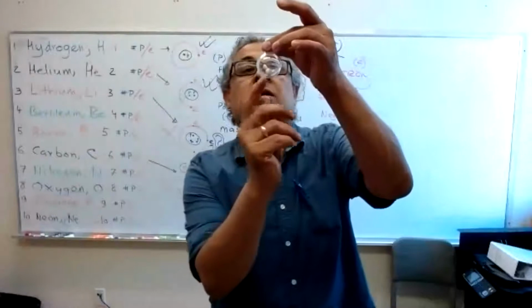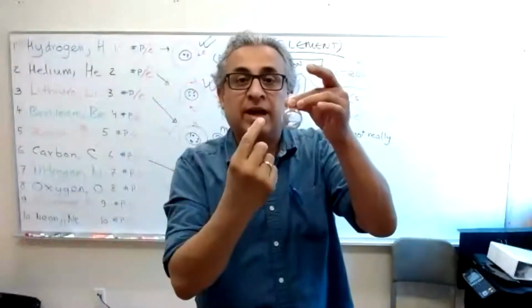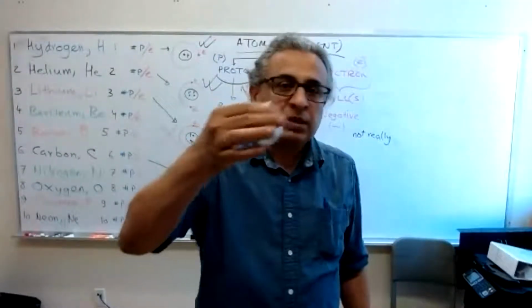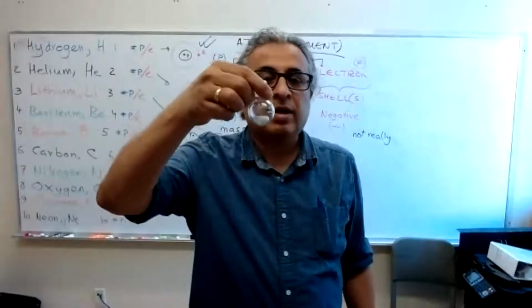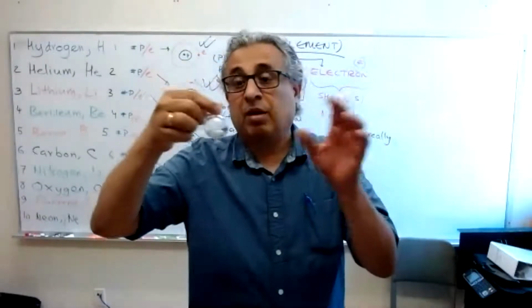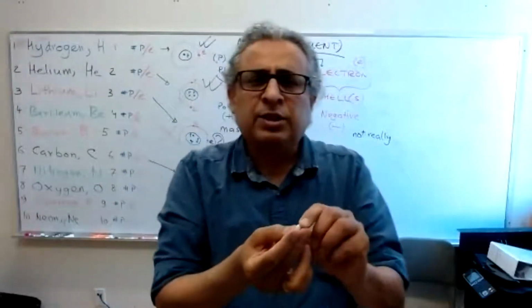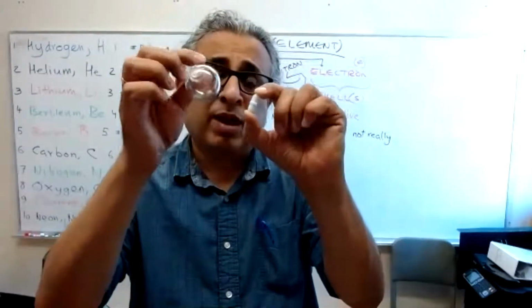So as it starts turning, it churns whatever is inside. Otherwise, the other option would be that for 4 hours, some guy is going to be doing this. Okay, that's ridiculous, right? We are all efficient, not lazy. So as it turns, it mixes things. So aren't you worried that the material can actually react with your chemicals?